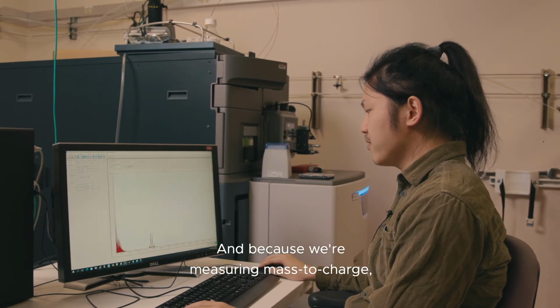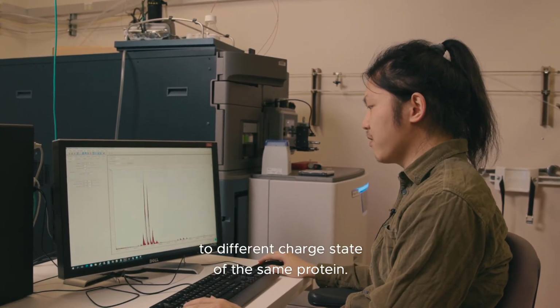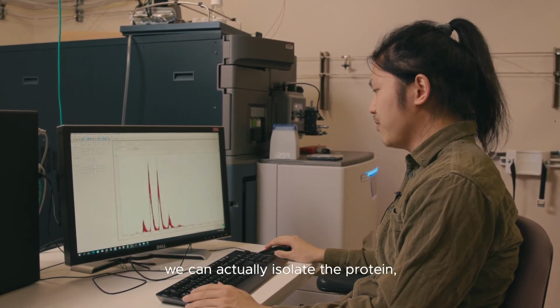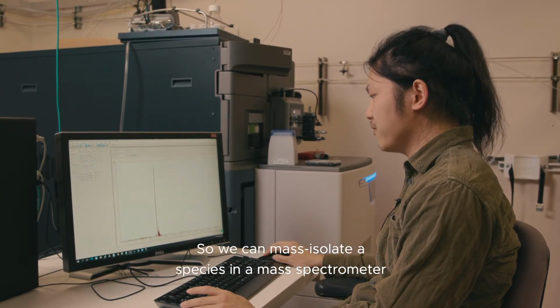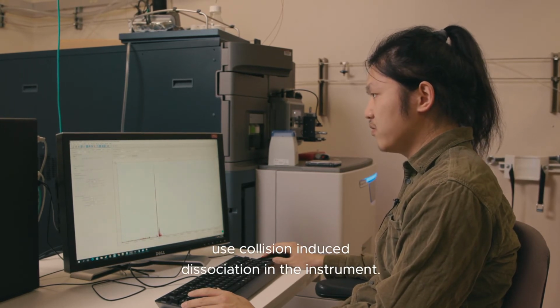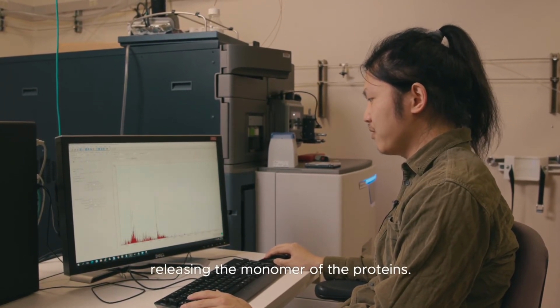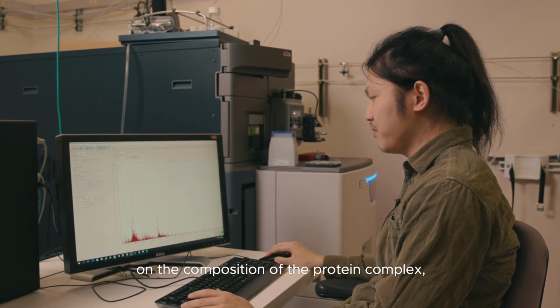And because we're measuring mass over charge, we actually see a few peaks that correspond to different charge states of the same protein. And what's interesting here is that we can mass isolate the pentamer species in the mass spectrometer, and then activate it using collision-induced dissociation in the instrument. This pentamer will be activated and fall apart, releasing the monomer of the protein. In this experiment, we can get some information on the composition of the protein complex.